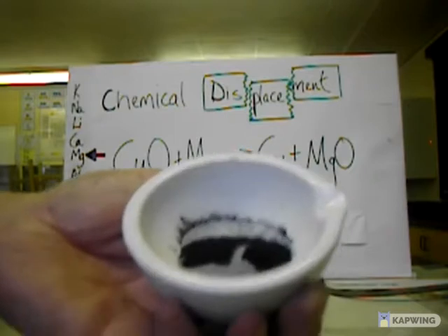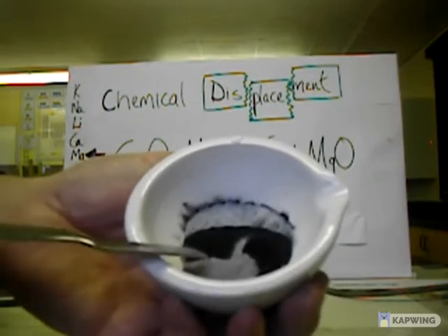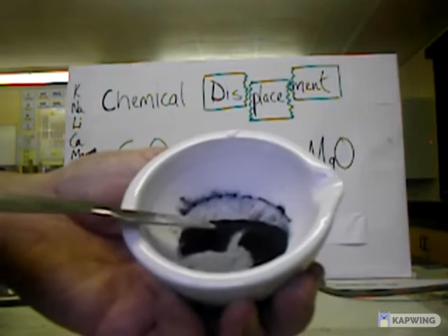I have here, in a mortar, a mixture of magnesium powder here, the grey powder, and copper oxide, the black powder.